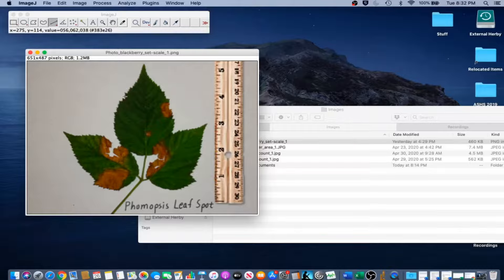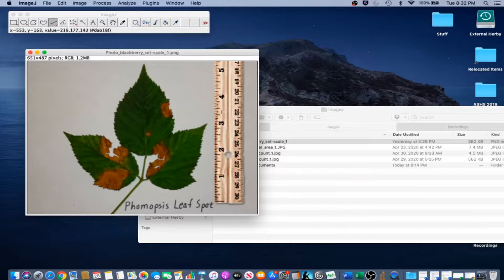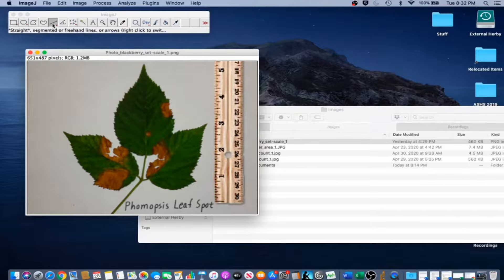This is a photograph of blackberry leaves laid flat on a piece of white copy paper. If taking photographs indoors, use a tripod to keep the camera steady in the same spot for the whole set of images. Lay the leaves on a high contrast background like a white sheet of copy paper. Include a reference object of known size in the image, like the ruler in this image, so the image can be scaled. The reference object used for scaling a photograph shall always be large and near the object of interest.